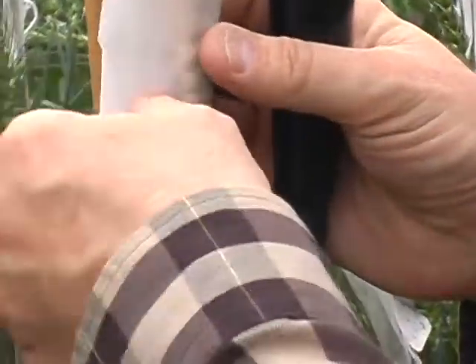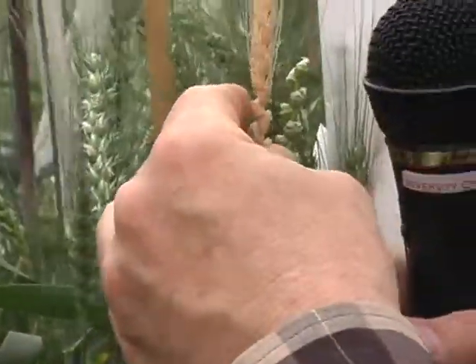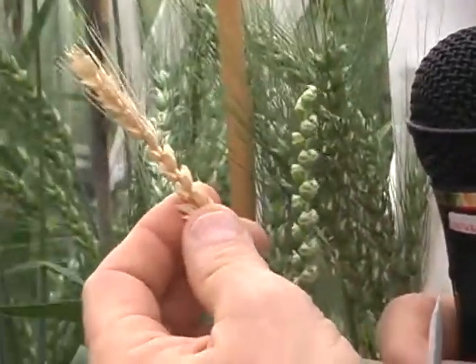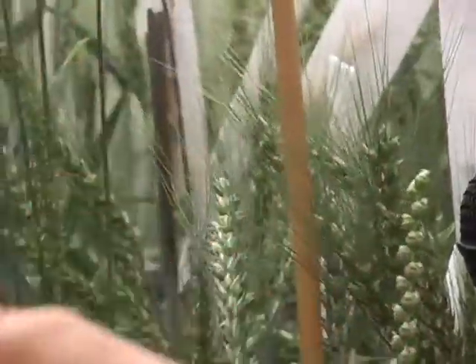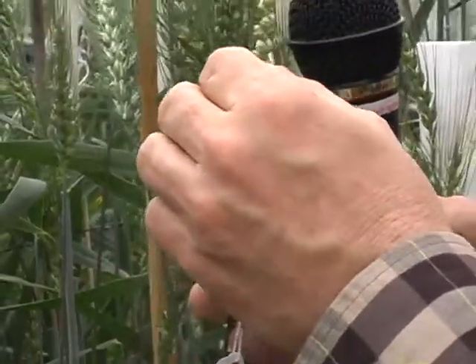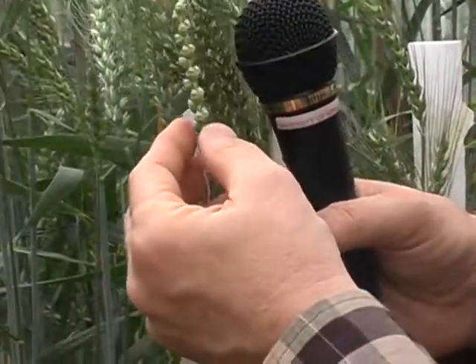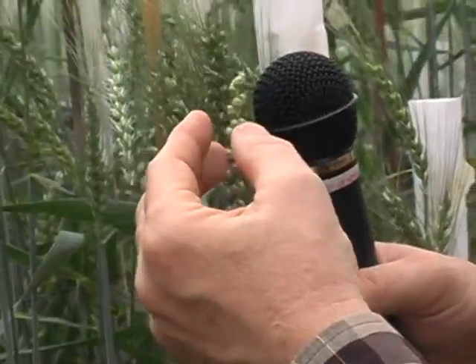What we would do is take a male plant and put it up above. Now if you look at this, that male's completely dead. That's because it was cut off, put in a tube of water, and allowed to live three or four days to pollinate this cross we made. And you can see the excellent seed set that we have.